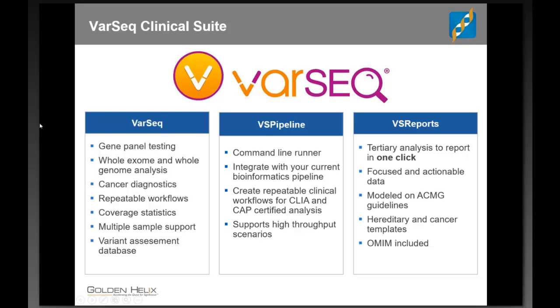So we have VarSeq, which can handle gene panels, whole genomes, has this concept of repeatable workflows, which we'll talk about more after when we start to dive into what it takes to create a test. We support multiple samples, and we can even make variant assessments from within VarSeq and capture that outside of a project. This VS Pipeline product that we've launched just recently allows that linking between what comes out of the sequencer to utilize VarSeq and do some steps automatically, such as preparing projects that are running the VarSeq workflows, and allows you to support that high throughput scenario.